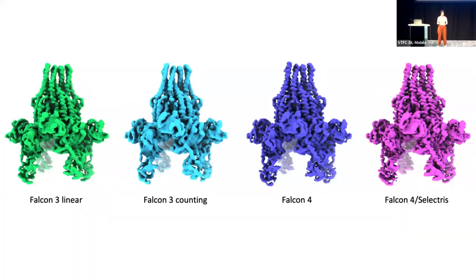So yeah, we've got structures. None of them are junk. They all look as they should for the biological specimen.